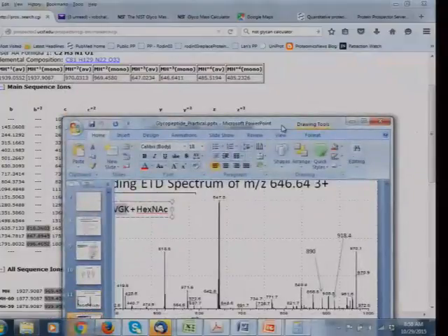So if you zoom in on these peaks, they actually have isotopes. It's not just a single peak. I was trying to gloss over this. 99% of carbon is carbon 12, but 1% is carbon 13. Obviously 1% doesn't sound very much, but if you've got a molecule that contains 100 carbons, then all of a sudden that second isotope peak is going to be as big as the first isotope.